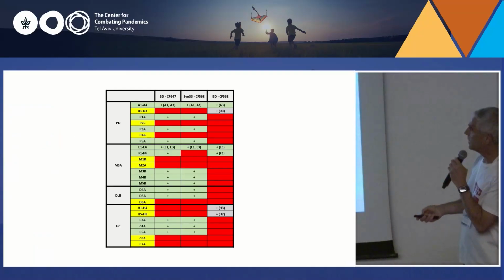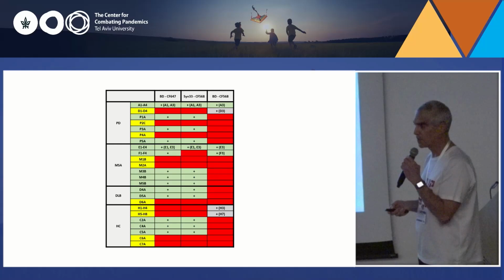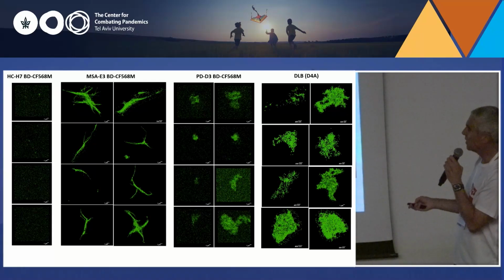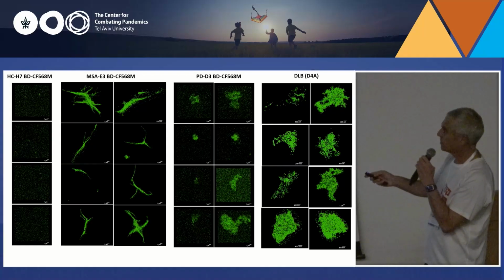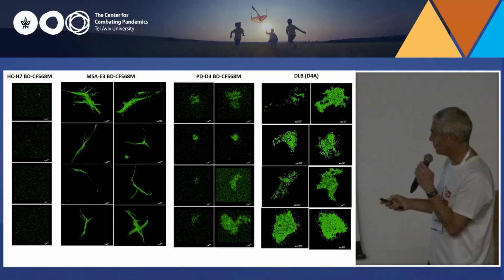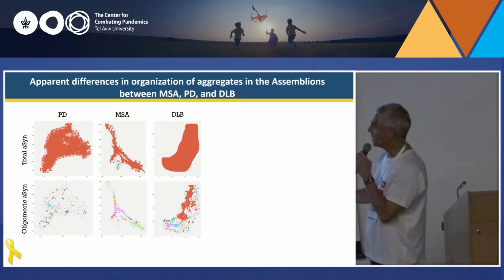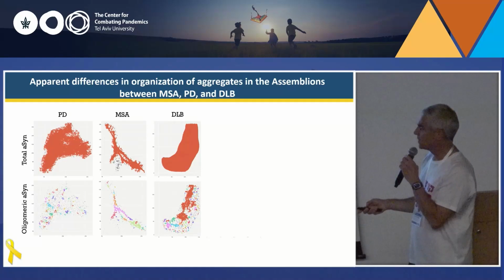So with that, we have a list of patients that we received a CSF sample from. Hopefully, we'll also get brain samples. I'll skip that. You can also see this is just a gallery of many cases. MSA patients look very similar to each other, PD look different, and DLB look different from the rest. What we can do now is apply our algorithm analysis and get different combinations of aggregation in the different types of the diseases.